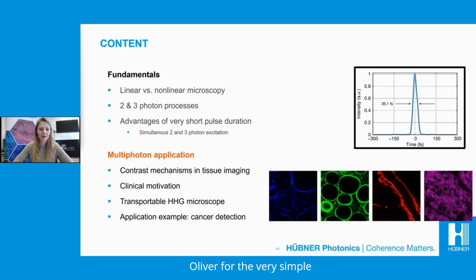Thank you, Oliver, for the very simple explanation of the fundamentals of nonlinear microscopy. So I will now take it over and explain you a bit about multiphoton microscopy applications. And I will start with explaining what you can actually see with those 2 photon and 3 photon processes.